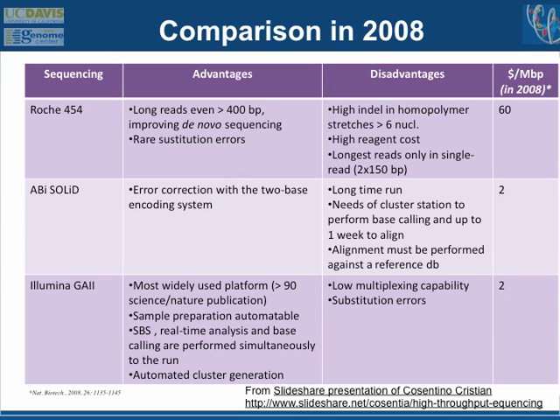Each of the methods has advantages and disadvantages in terms of accuracy, the ability to make large insert libraries, and the ability to do different types of chemistry and sequencing. Some work well with PCR products. Originally, Roche was the place where people went if they wanted to PCR amplify something and then sequence it, like HIV sequences from a quasi-species or ribosomal RNA sequences from an environmental sample. The other methods have now basically caught up, so they have developed ways to take PCR products and feed them into the sequencing systems pretty well.